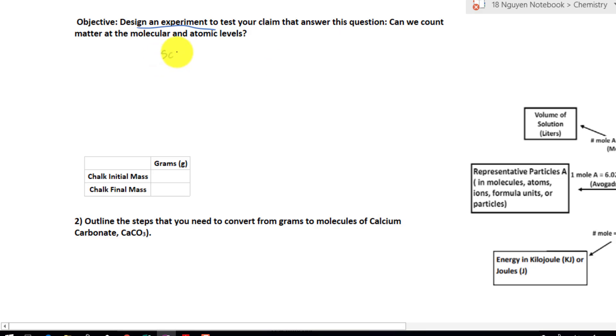First is the scale, that's the equipment, and then we have the substance that we are going to look at. In this case, it's chalk, and chalk is basically calcium carbonate.